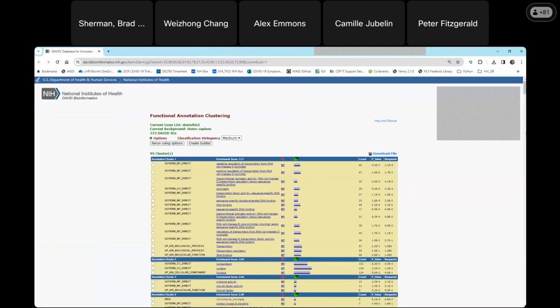Okay, so what this does is it takes that chart report and it uses that kappa similarity score, and then we created a fuzzy clustering heuristic to use that similarity score to pull together similar terms.